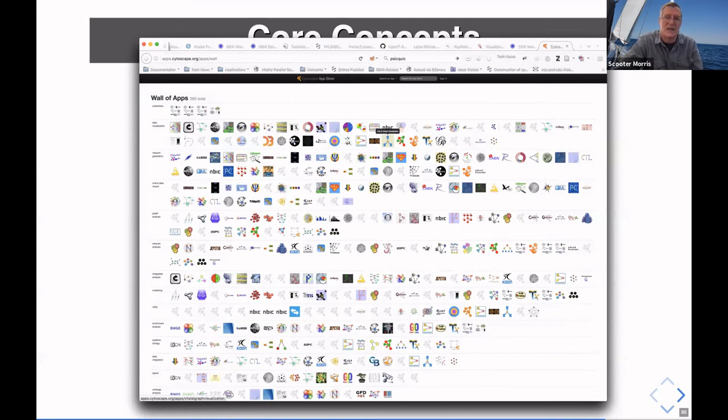exploring new apps. I'm on a project right now which is building a huge graph database. Contains everything from food to chemicals to genes to proteins to pathways to diseases, phenotypes, symptoms. Trying to think of what else is in here in Spoke. And it's obviously web-based and people can browse it. But now there's an increasing push to get a Cytoscape app that will allow you to query this and get the neighborhood within Cytoscape.